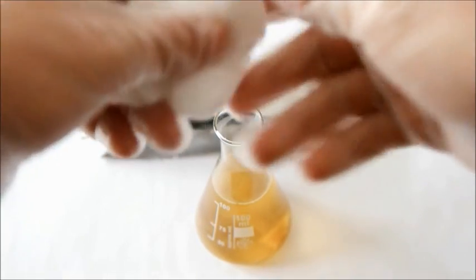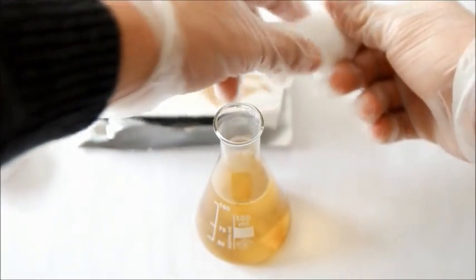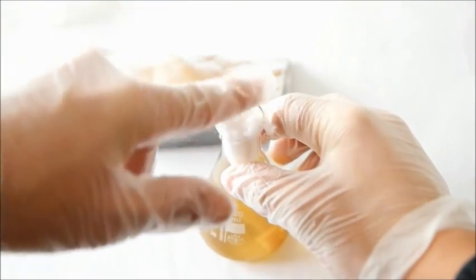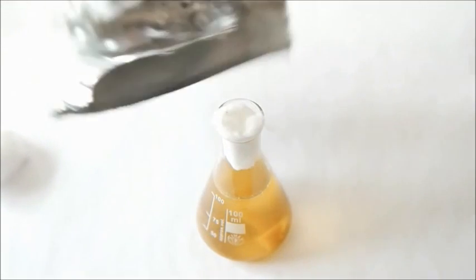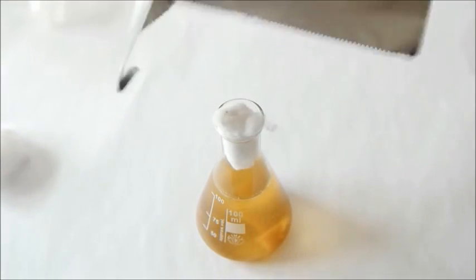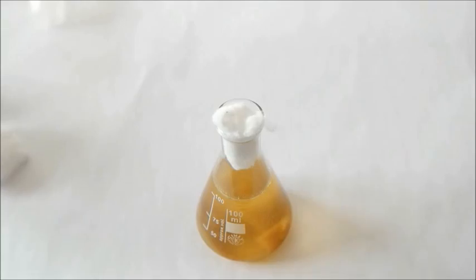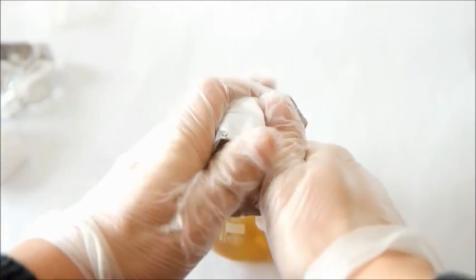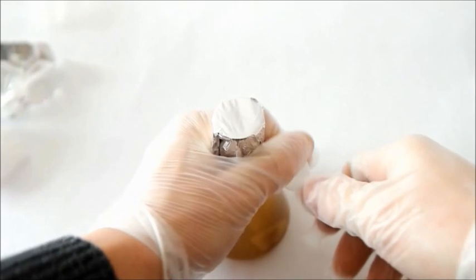Now close your Erlenmeyer flask by putting a big cotton ball in it and then put a piece of aluminum foil on it. It doesn't have to be air proof but just close it like this.